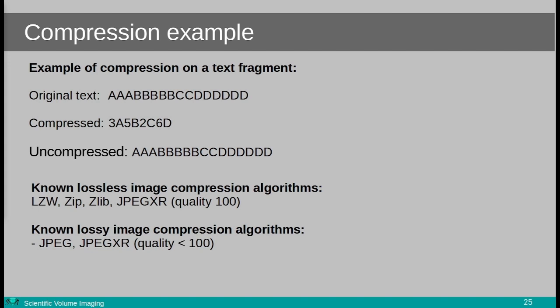There also exist lossy compressions, which is used in JPEG, for instance. As an example, opening and resaving JPEG files multiple times will pile up compression onto compression onto compression, leaving you with artifacts in your image. And these can then in turn also influence your deconvolution results. Our HDF5 file format has the ability to save files with lossless compression at the cost of taking a little longer to load and save the file when loading or saving in Huygens. Let's now take a look at a demo for file conversion and file saving in Huygens.